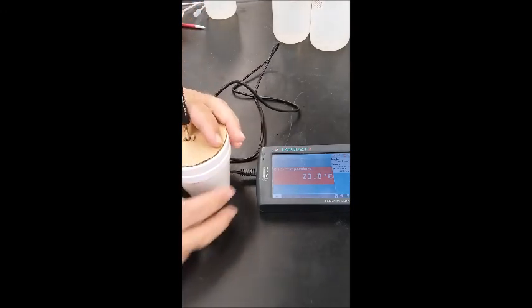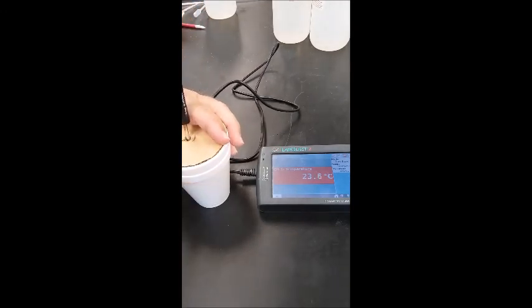We see that the initial temperature of the acetic acid is 23.7 degrees Celsius. Having cleaned the thermometer, it's now inserted into the sodium hydroxide.